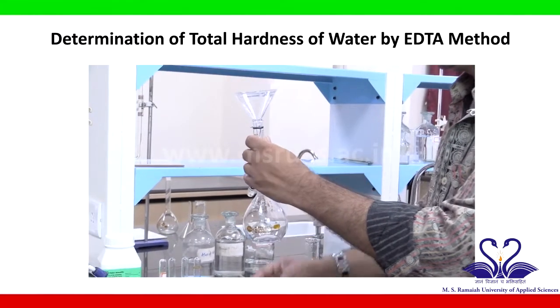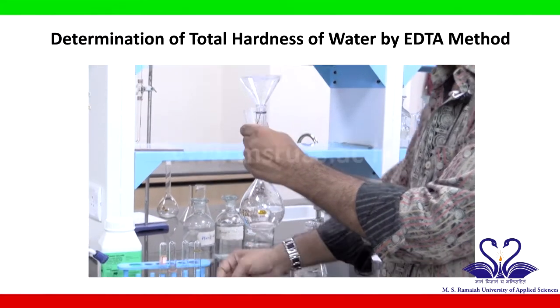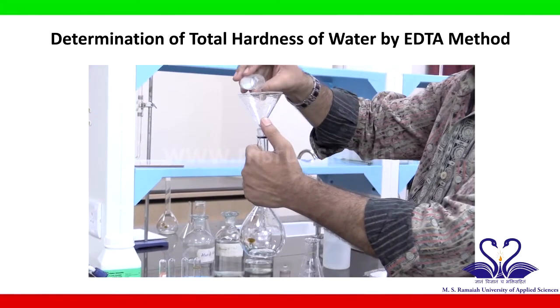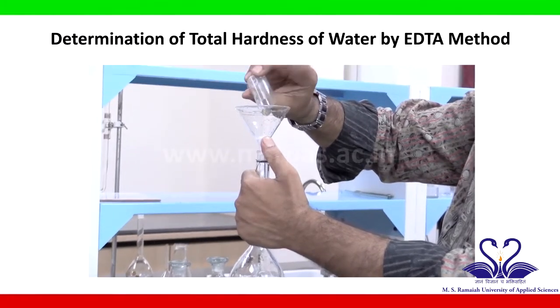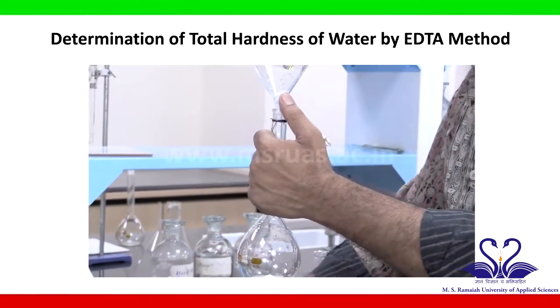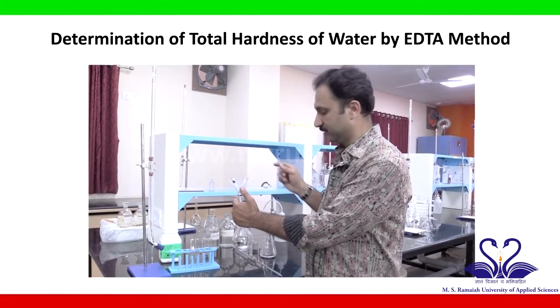Add the funnel. Transfer the known quantity of EDTA sample completely.